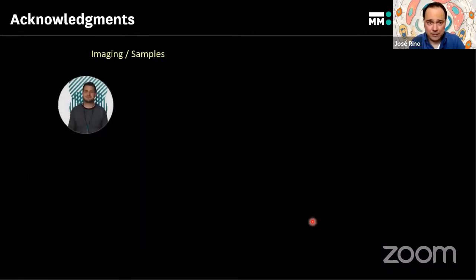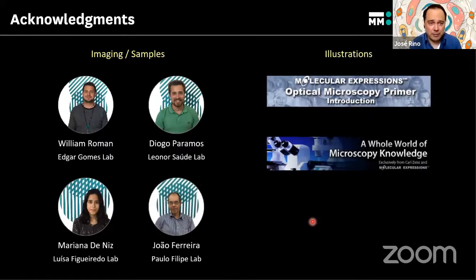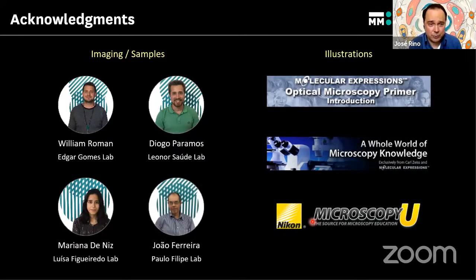Okay, so this was a very brief introduction to confocal and optical sectioning. I just want to thank the people at the IMM who gave me the images or samples to image: William, Diogo, Mariana, and João Ferreira. Many of the illustrations that I've shown come from the Molecular Expressions Optical Microscopy Primer and versions of that from different companies. These are great educational websites with full detailed explanations, and I really encourage you to have a look at them. They are not only visually very beautiful, but they have a lot of knowledge. It's a very good starting point for beginners.